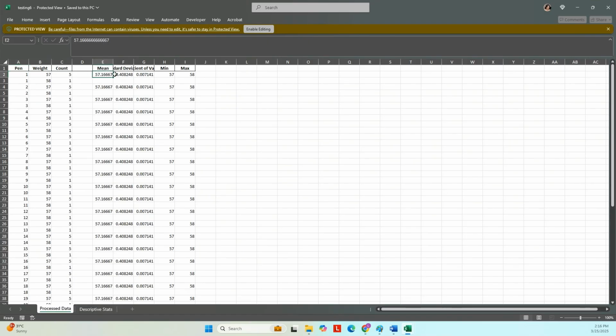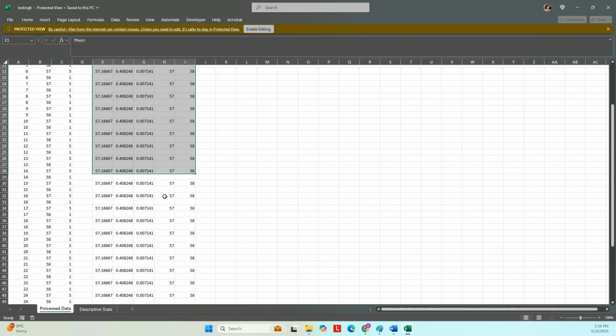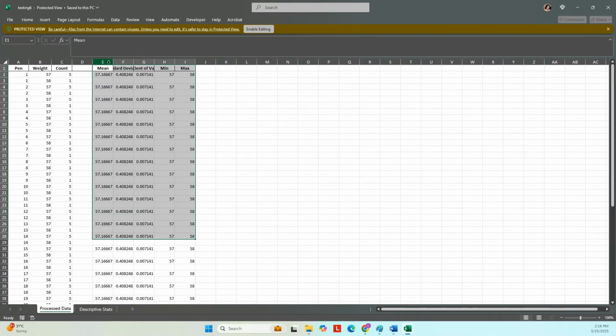We have a summary statistic. Since I am allocating just 6 units, the summary statistic looks very close together, but when our number of experimental units is higher, it will look more spread apart. From the summary statistic we have the mean, standard deviation, coefficient of variation, and minimum and maximum data.